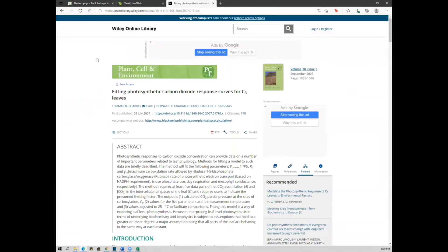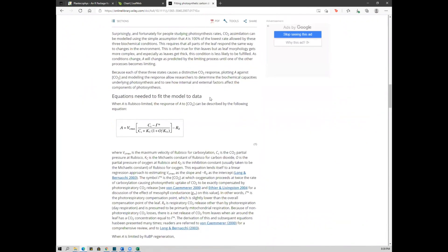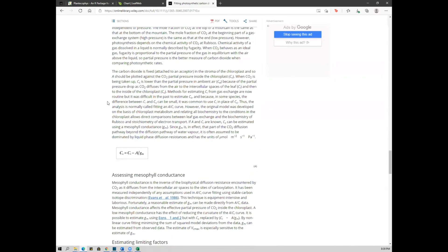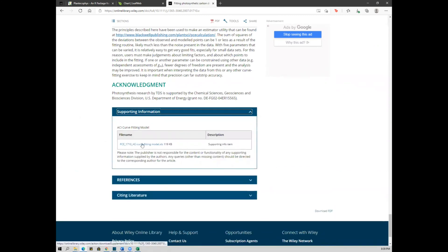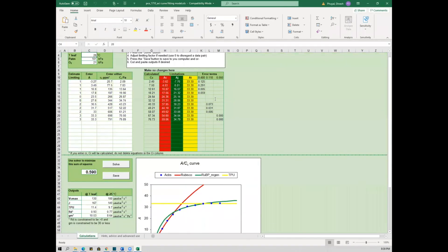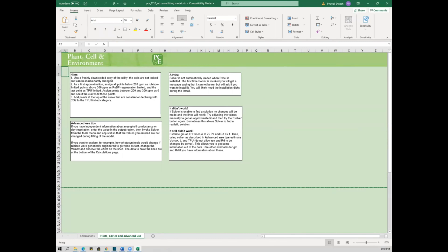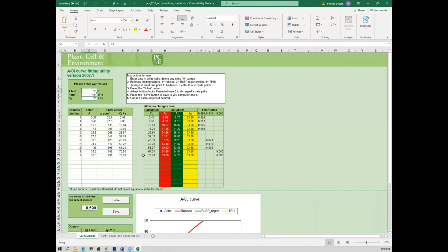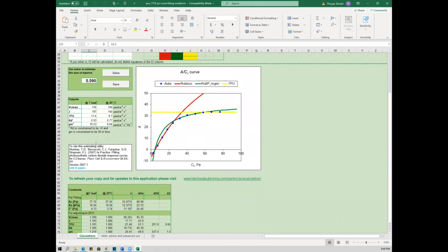The third option is the ACI Curve Fitting Tool by Sharkey et al. This tool requires at least five data pairs of A and Ci values, including the presumed limiting factor. There are instructions to fit the data and it gives you the output. You download an Excel sheet — a new one each time you have a new dataset — and can easily analyze your data using the template. It provides many values and variables, gives VCmax (maximum rate of carboxylation), Jmax (maximum rate of electron transport), and TPU (rate of triose phosphate utilization).